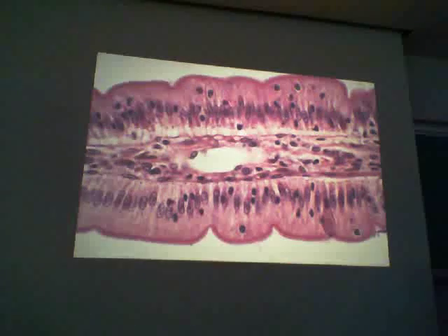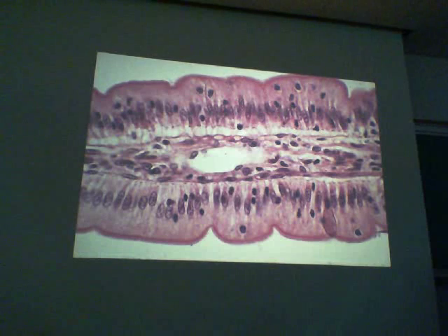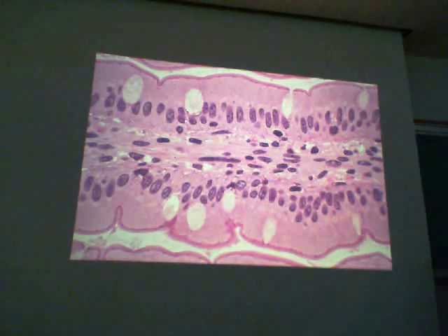And how about this tissue? Simple columnar epithelium. Now we do see some other nuclei here. Those are lymphocytes that are migrating through. So this is simple columnar epithelium. These are not really part of the epithelium. This is just transient. Okay, and right here we have a cell. What is that? Goblet cell. And this tissue, again, is what? Simple columnar epithelium.